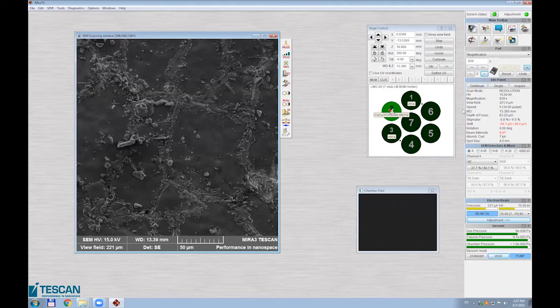Okay, let's stop it and let's quantify it. By auto quantification, you have an idea of what is there. Okay, I apologize that I forgot to put the software.